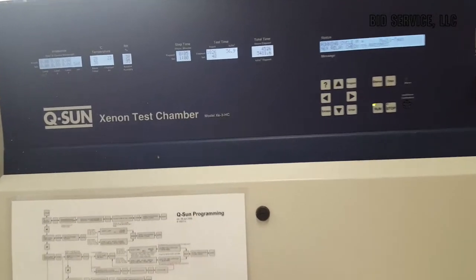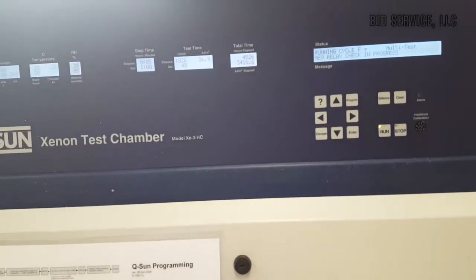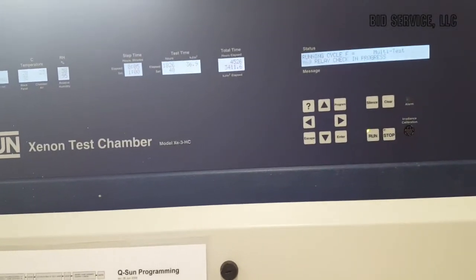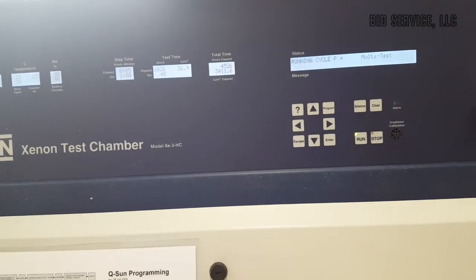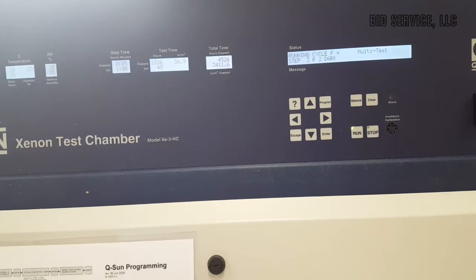Again, it's approximately 30 to 45 second delay while it runs through its system checks.